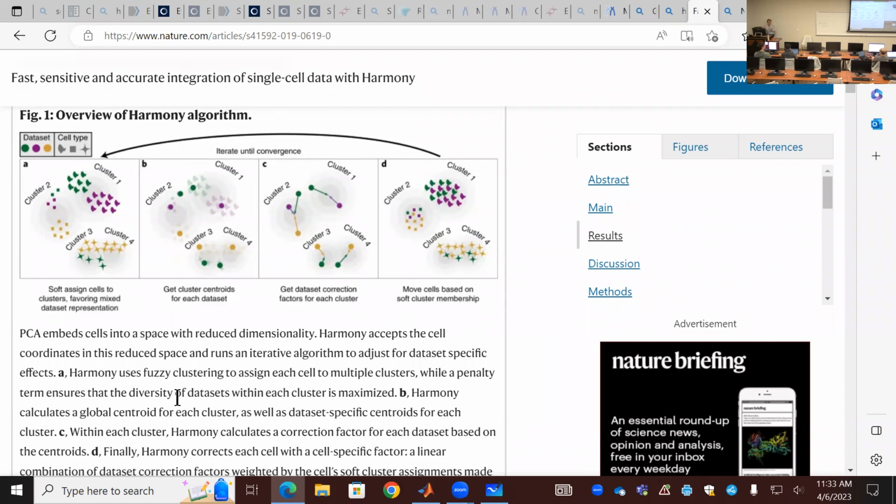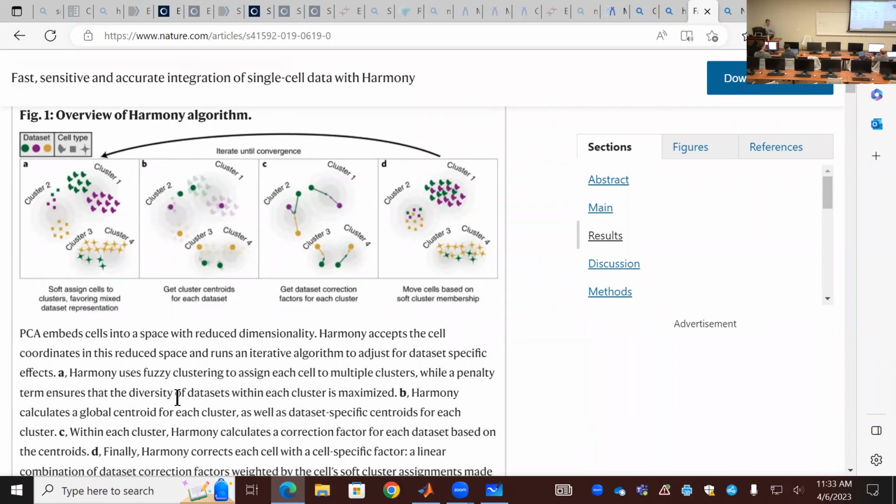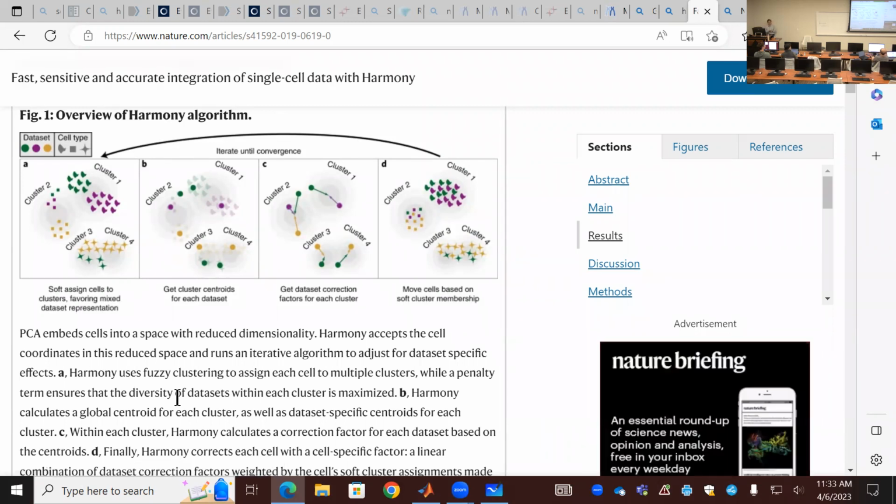So this is purely a data-driven game, okay? This is a data science game. The only input information is the position of those cells, okay? Coordinates in 3D, and then their labels, the categorical labels, which cell belongs to batch 1, which batch 2, batch 3.